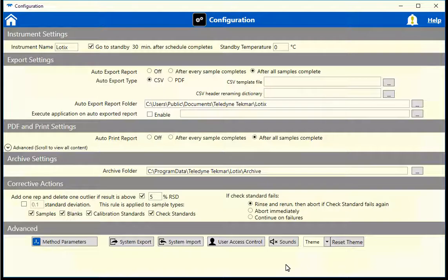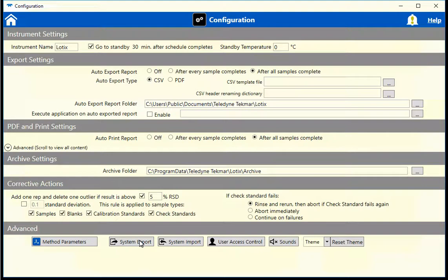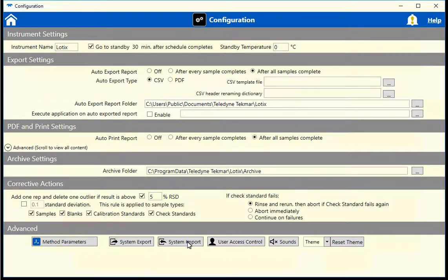System export will collect all the data and package it in a zip folder for ease of sharing with others. If the software gets updated at some point, all data will need to be re-imported into the software and can be done by choosing System Import and selecting your archived file.